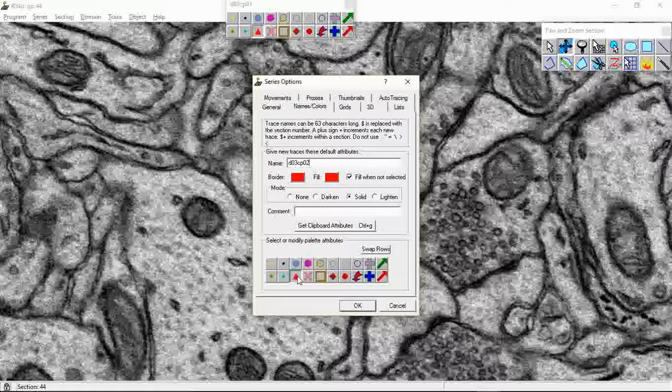And for this demonstration, I'm just maintaining one stamp for my P stamps, but generally I'll make a whole row as all red triangles, so that way I don't have to constantly come back to the series options to change the name.